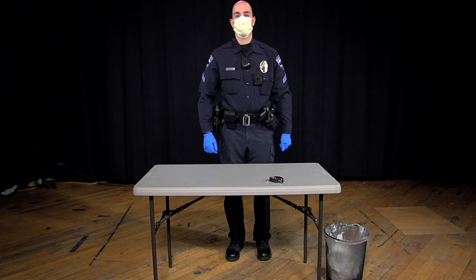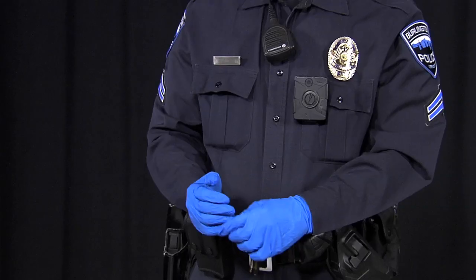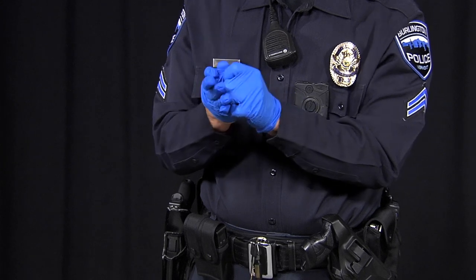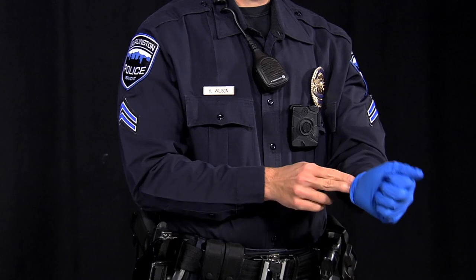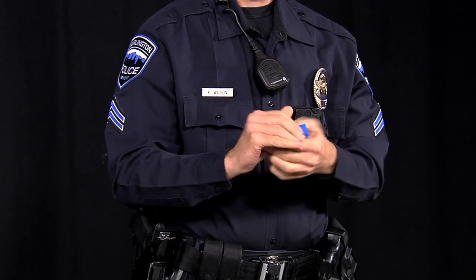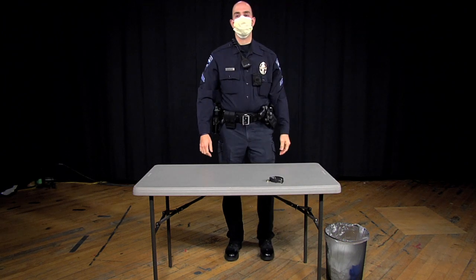Next you will remove your gloves. The gloves come off before removing the mask in case your gloves are contaminated — you do not want your contaminated gloves near your face. Grasp the palm of the other hand and peel off the first glove. Hold the removed glove in your gloved hand. Slide the fingers of the un-gloved hand under the remaining glove at the wrist and peel off the second glove over the first glove and discard.